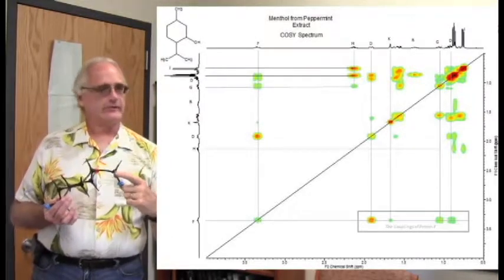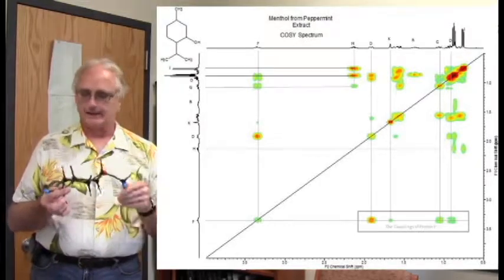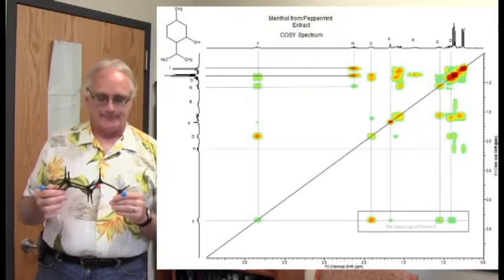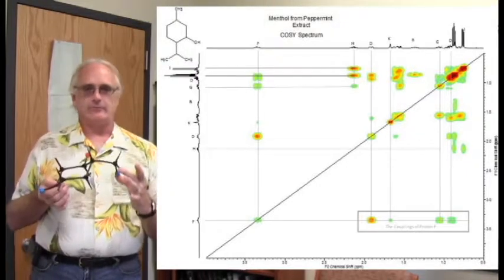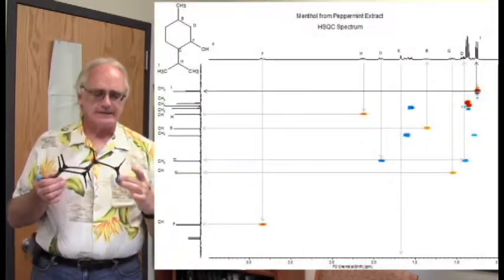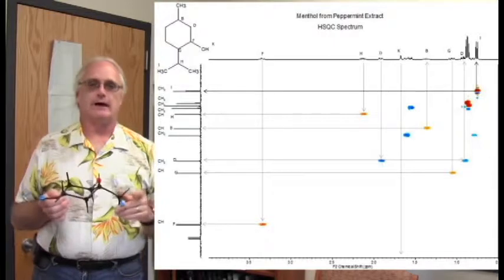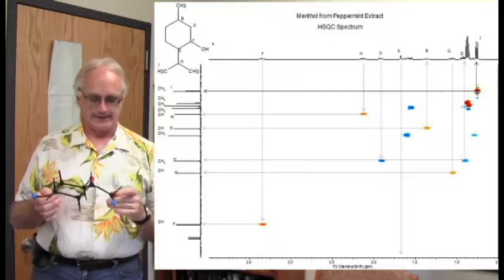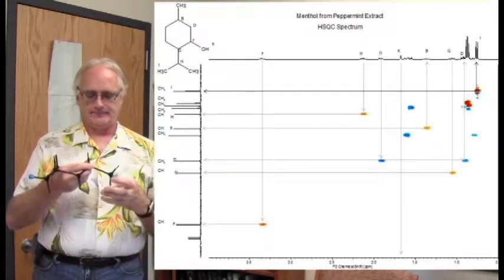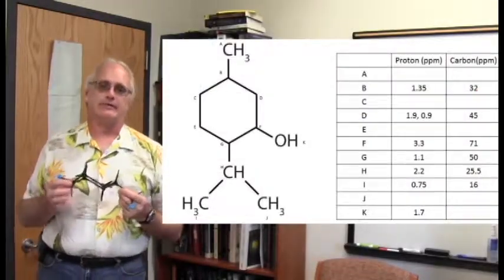And these two are the ones that are not over the top of each other. One of these is 0.7, one of these is at 0.8, and then the other one is also up there at 0.8. Now, that allows me then to find these two positions and the corresponding carbons. In reality, I've labeled them I and J, and they have separate lines on our table that we're filling in. But with free rotation about this bond, is this one I and that one J? That one's actually a little bit ambiguous.